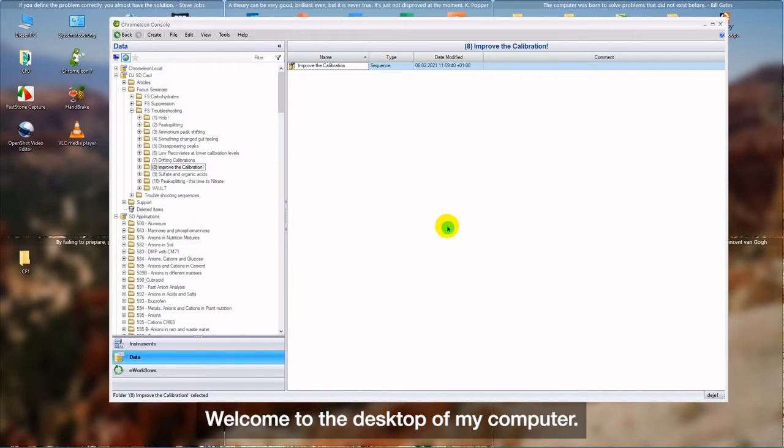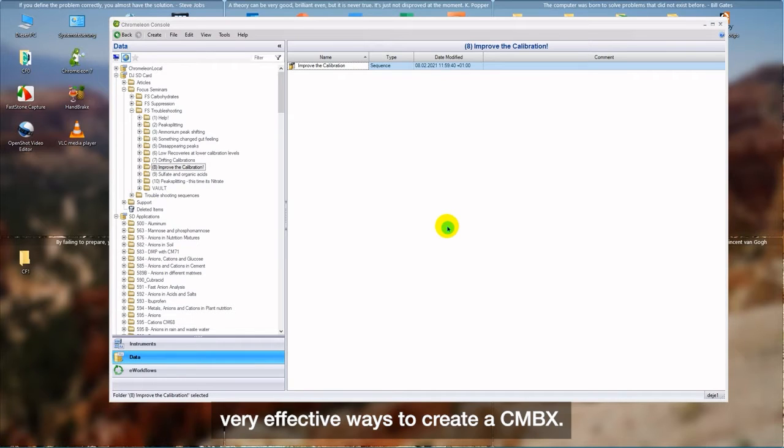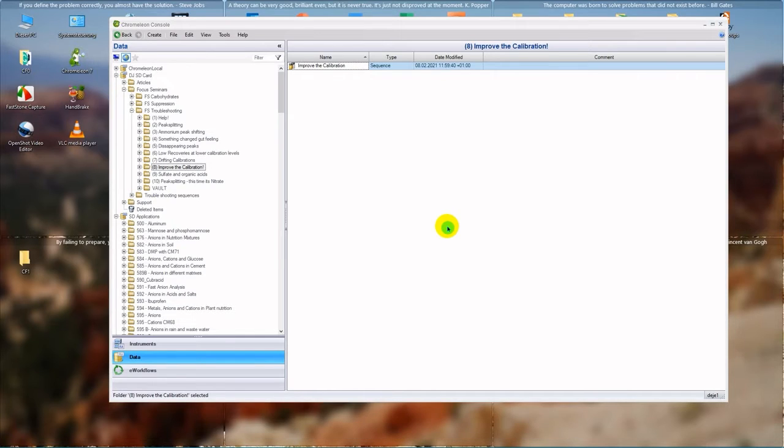Welcome to the desktop of my computer. Let's talk about two simple, yet very effective ways to create a CMBX.